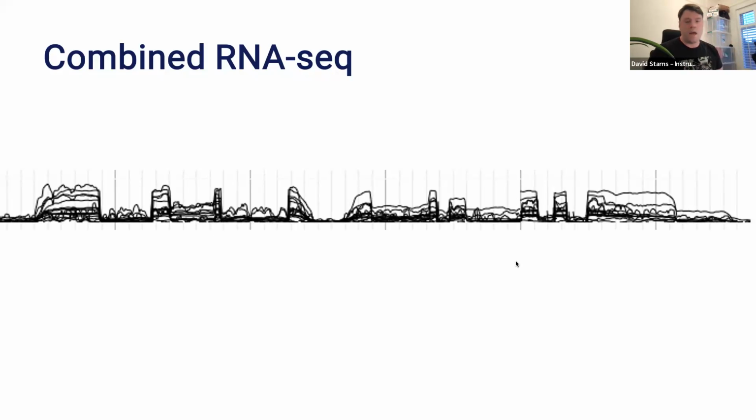And in some arthropod species, you can actually see where the coverage is, and you have intronic genes, and you can demarcate them, if that's the word, from the enclosing gene.